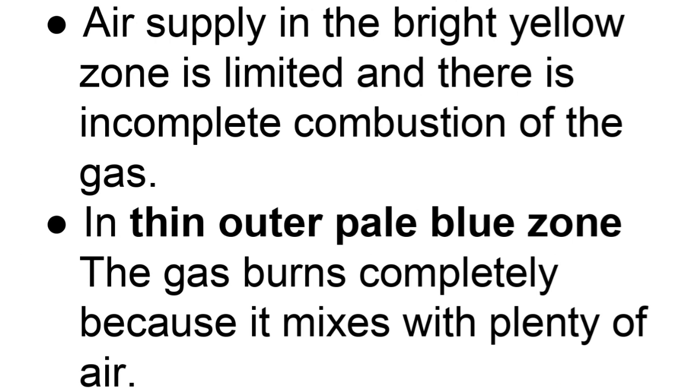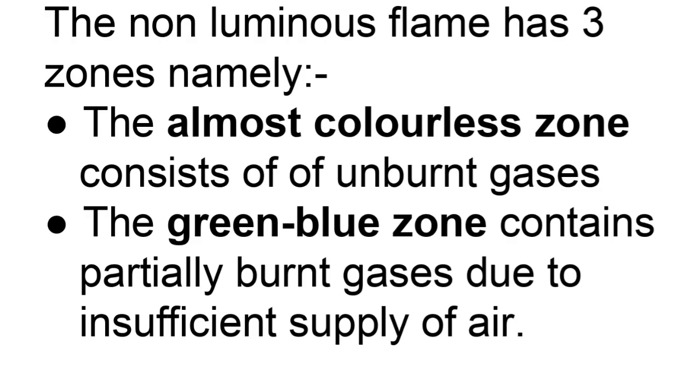But something to note about this pale blue zone is that it is very difficult to see it. When you're looking at a luminous flame, you may not be able to see the pale blue zone, but just know that it is there. And let's move on to the non-luminous flame.